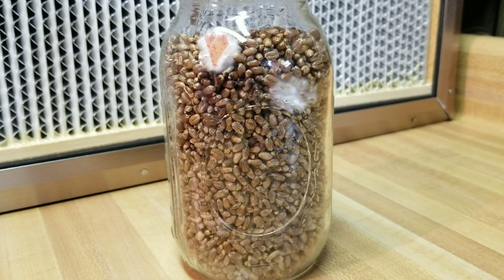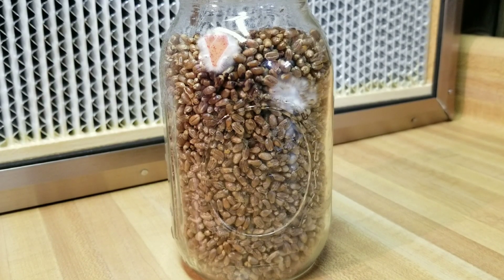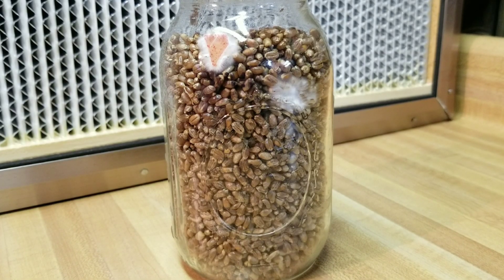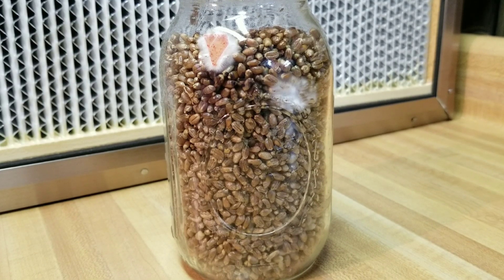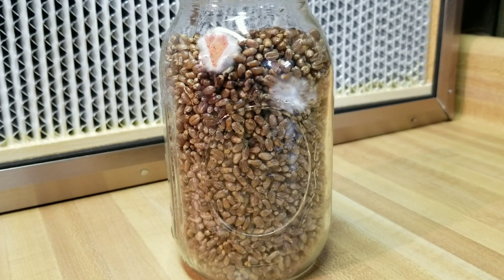Keep in mind that every species or strain grows a little differently in terms of its mycelium - some are very thick and white, others are very thin and wispy. With Hericium species that's especially true. A lot of times people who've done oysters and then try a Hericium strain like lion's mane just don't see the mycelium growing because it's so fine and wispy at first. So just keep in mind that every species and strain grows a little differently - unless you see other signs of trouble, give them a little time.